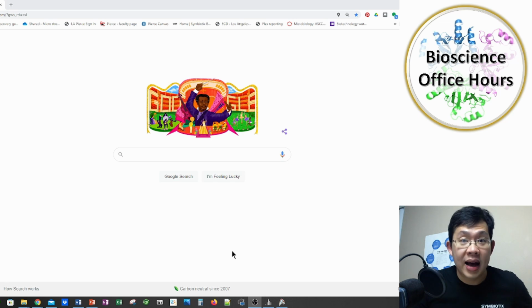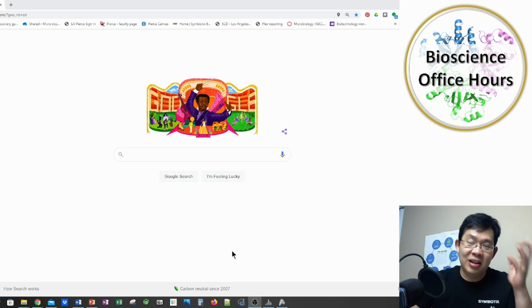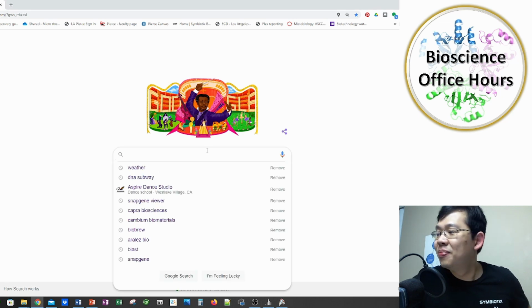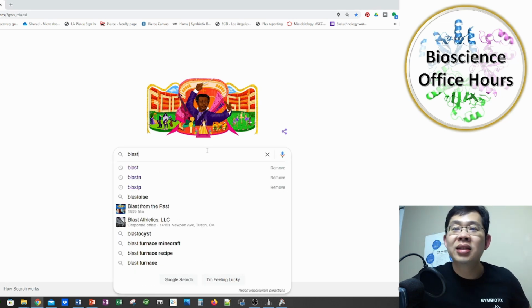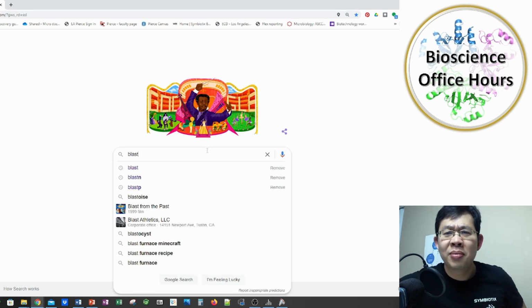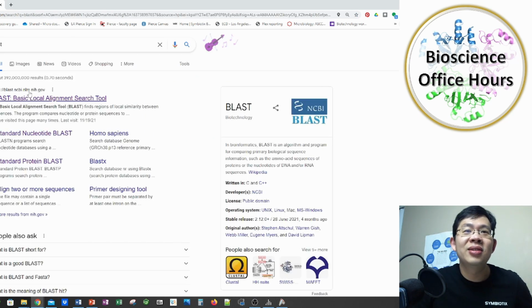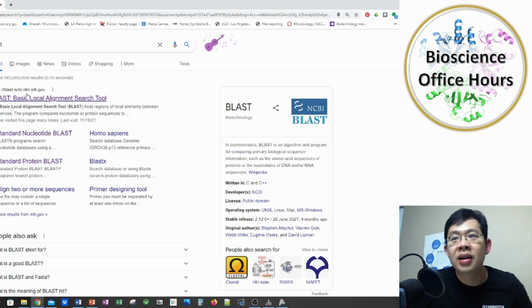We're gonna go to BLAST. So how do we find BLAST? Well, you can ask Dr. Google. Go to Google and then just type BLAST, B-L-A-S-T. Okay, just go there, BLAST, and then you go to the site maintained by NCBI.